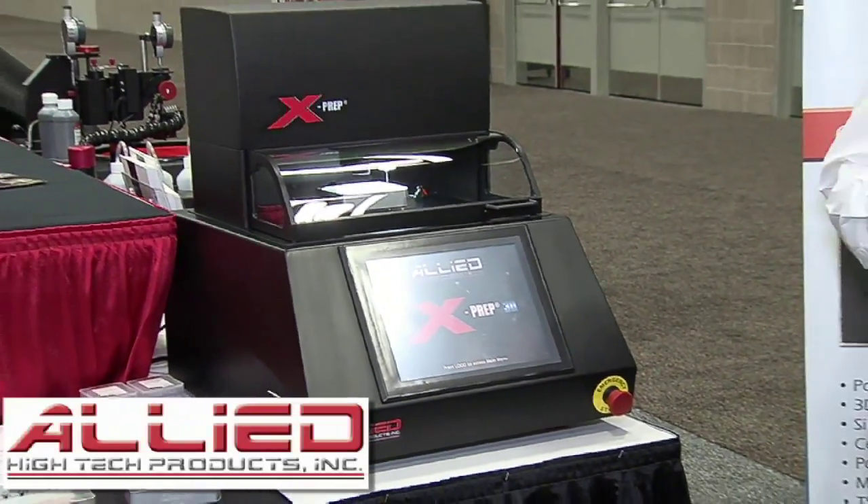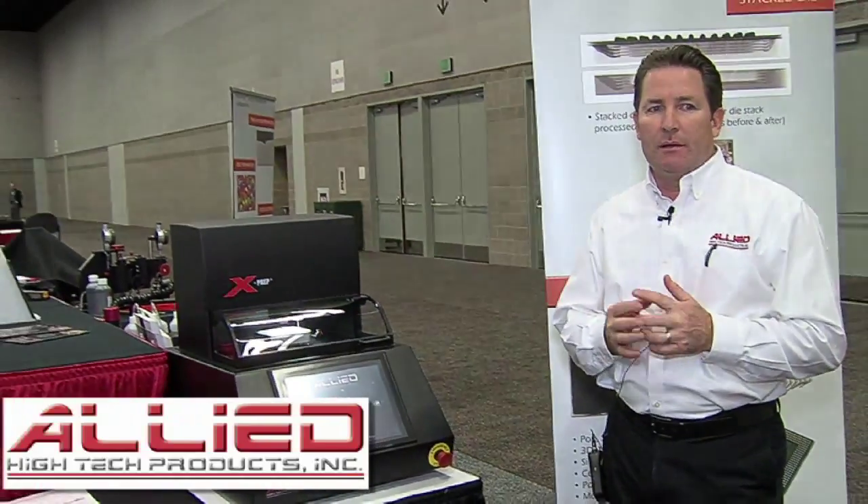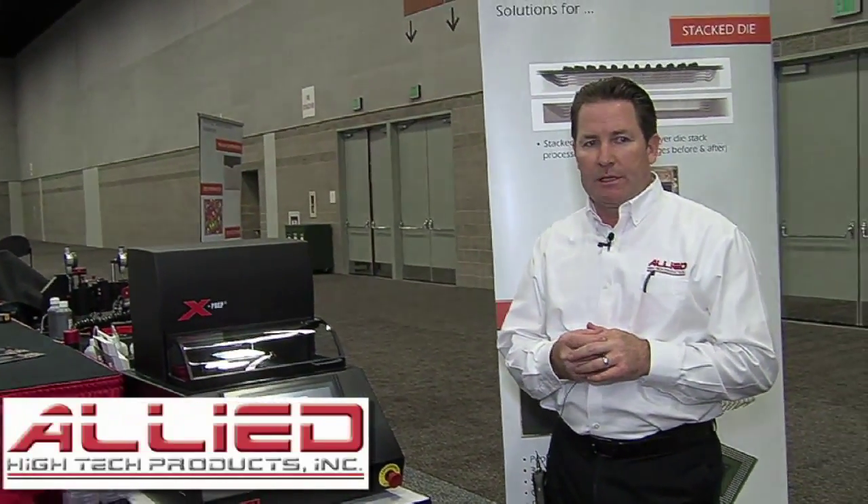Positioning resolution is dynamically displayed during operation with 100 nanometer resolution, and control of the Z-axis is accurate to one micron. A live HD 1080p camera with razor-sharp display is capable of producing sample magnification up to 375 times for extremely accurate X and Y positioning.